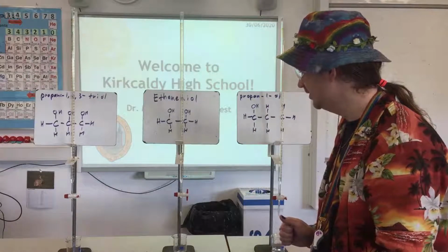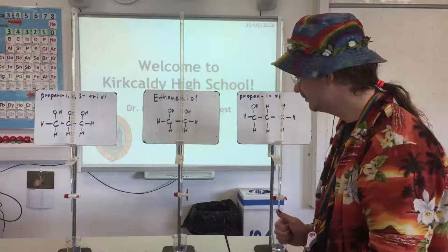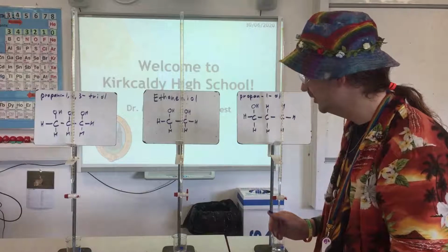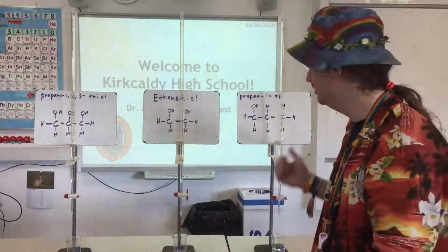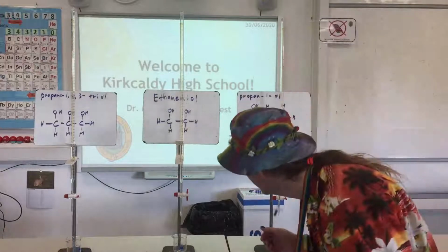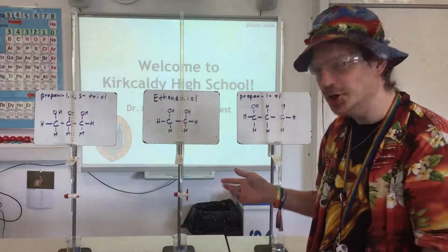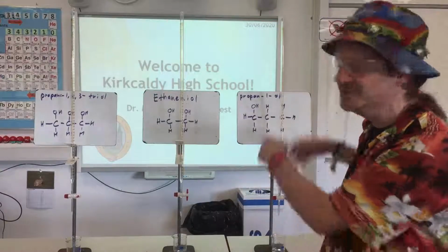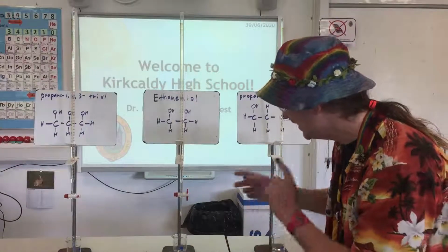That's us heading towards 42. 42 and a half. It's exciting stuff this. I hope you're sitting there with bated breath. 43. 43 and a half. 44. And I think you can already see that it's way slower going through the burette than the previous one was. That's us heading towards 46 just about. Quite a good time to sing a song, you know. Oh, the ethane diol goes to your burette and it's more viscous than the propane 1-ol, so it takes a while. And it's now at 47 and a half, heading towards 48.